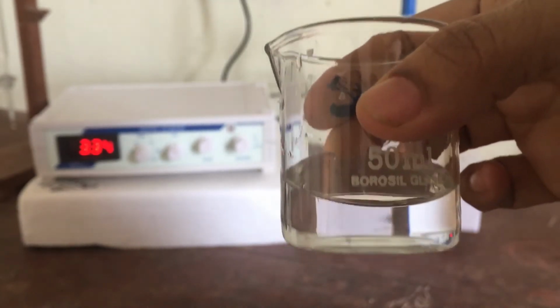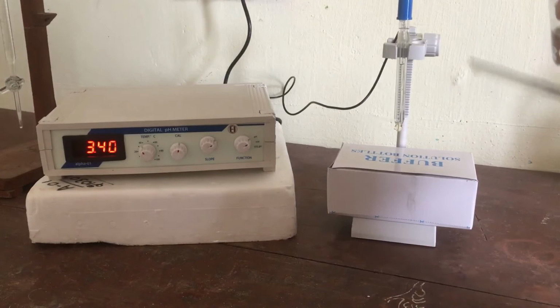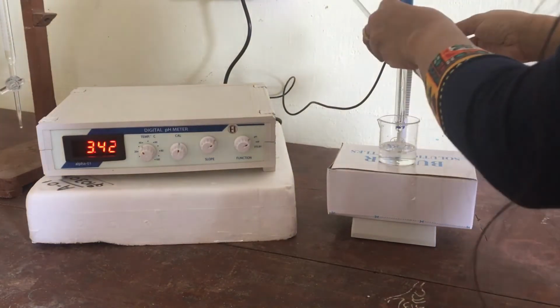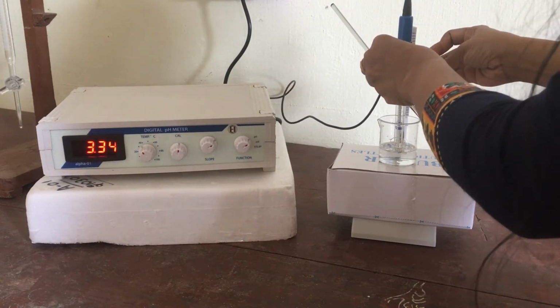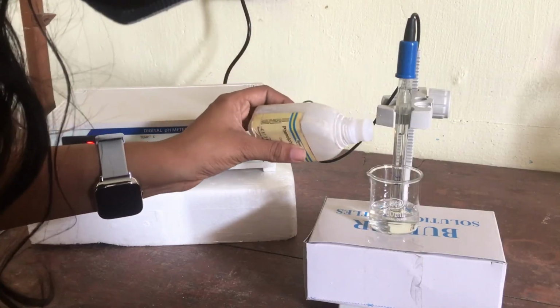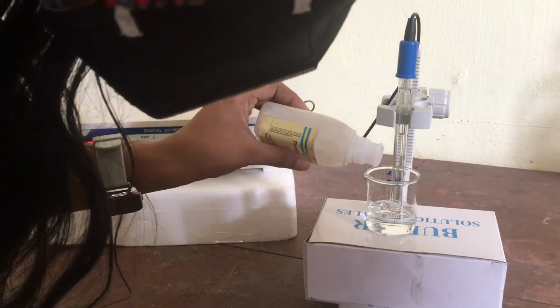Here we have taken 20 ml of acetic acid solution, and I am going to keep this under the electrode of a pH meter, which is already calibrated against standard pH of 7 and 4. After dipping the electrode properly in the solution, we need to add 1 or 2 drops of phenolphthalein to get the end point.